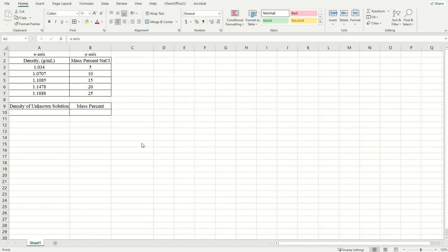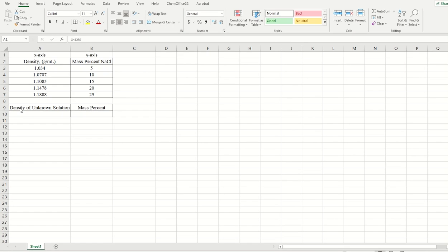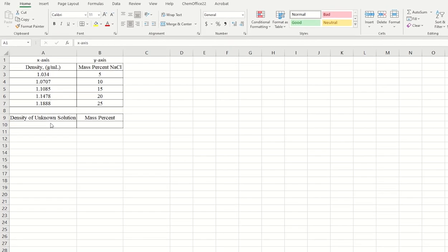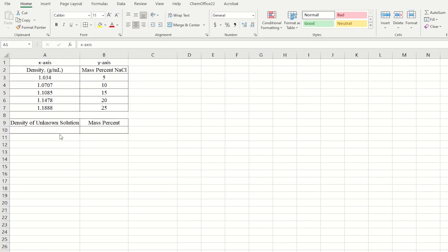In this video, let me show you how to create a calibration curve from our experimental data, and then how to find an unknown mass percent from a density of an unknown mass percent solution.